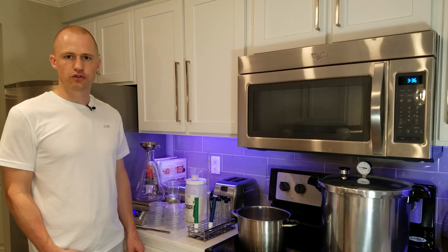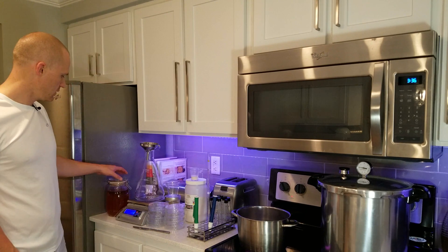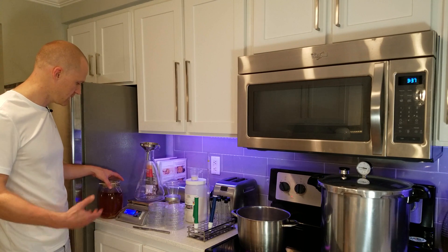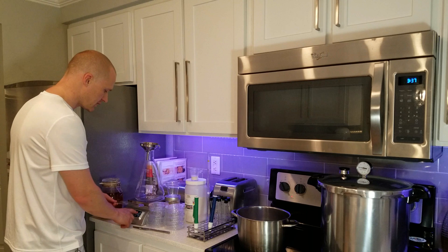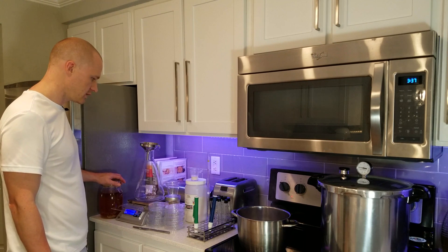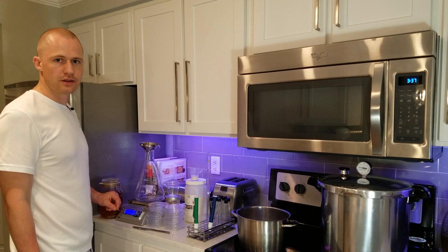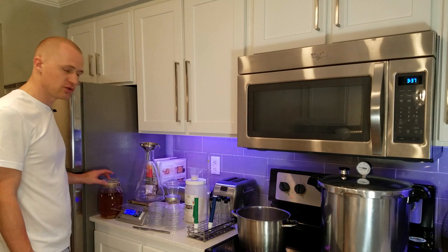First you need to make a starter — a regular yeast starter the way you normally would. If you've seen my other video on how to make shelf-stable starters, you've seen this before. This is basically just wort sitting on the shelf, ready to go at any time, and it is sterile. For this agar recipe you're going to need one liter of wort, 15 grams of agar, and any yeast nutrient you prefer, like Servomyces, if you haven't added it to the starter already.